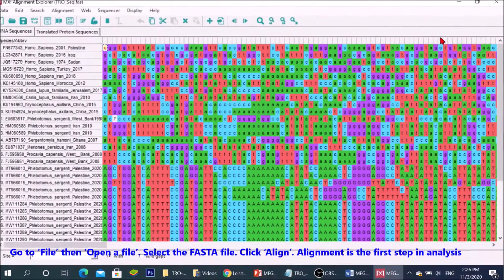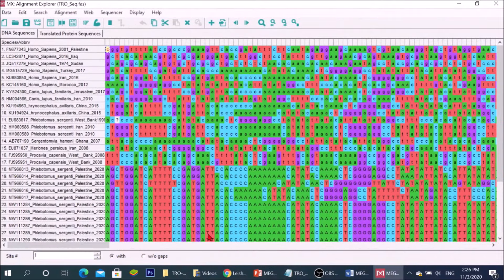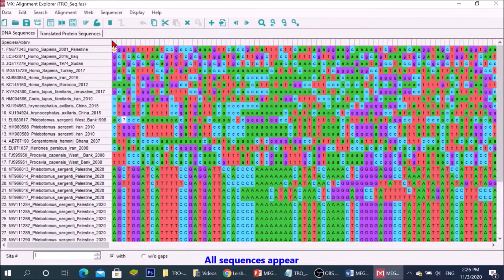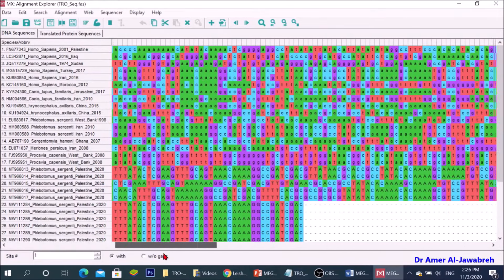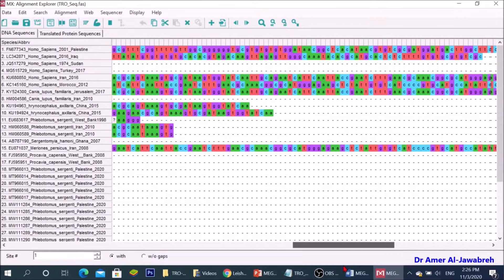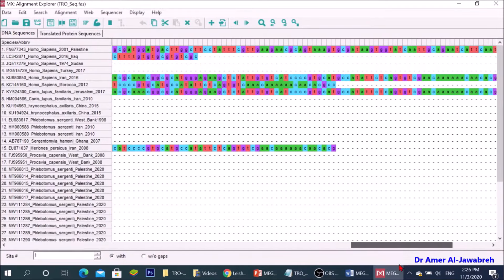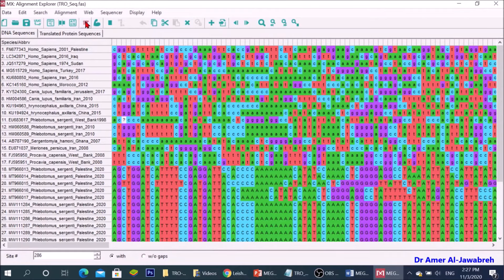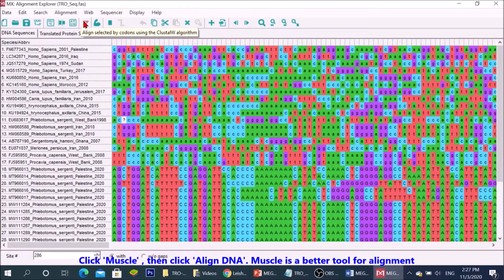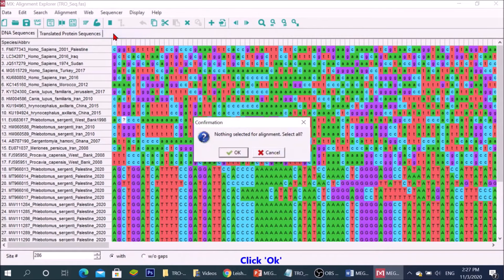Alignment is the first step in analysis. All sequences appear. Click muscle, then align DNA. Muscle is a better tool for alignment. Click OK.